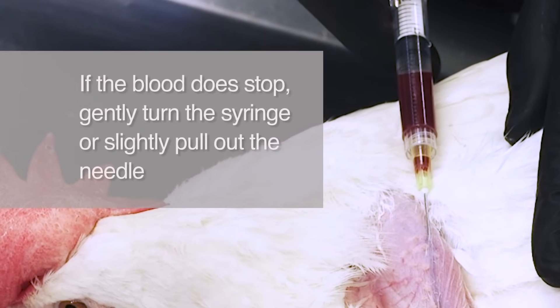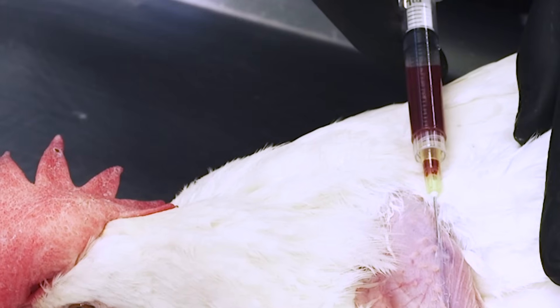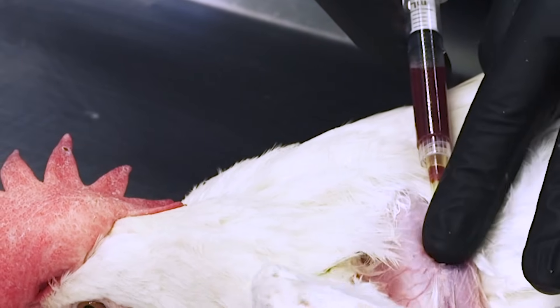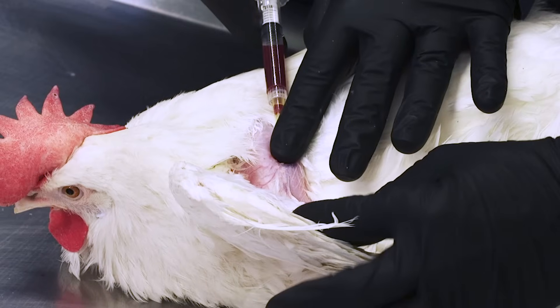Be sure to minimize any sideways movement of the needle. When complete, withdraw the needle and apply pressure to the puncture site for several seconds until clotting occurs. Despite the best of care, sometimes a small hematoma may still occur. This will not harm the animal, but may be a short-term cosmetic problem, especially if the bird is going to a show. The hematoma will harmlessly resolve in one to two weeks.